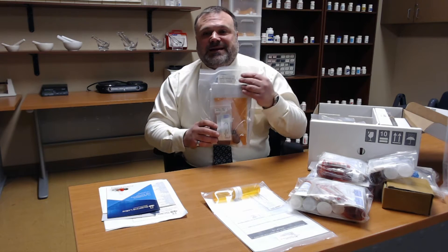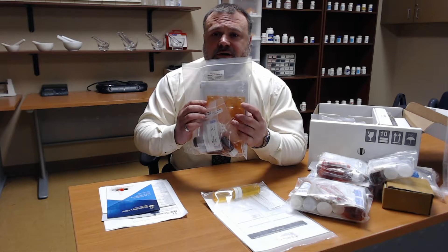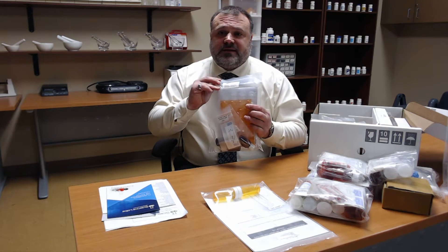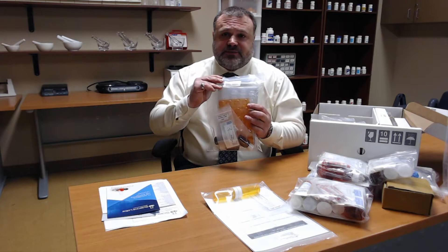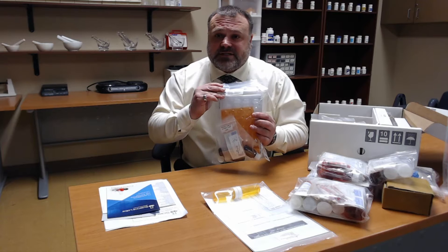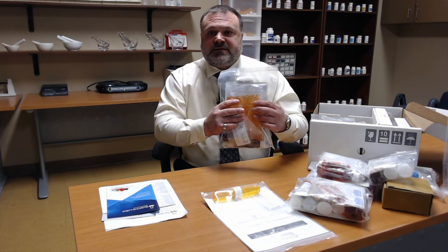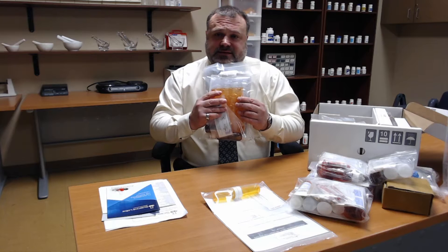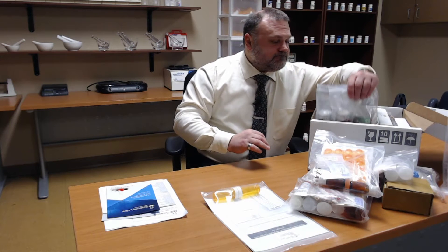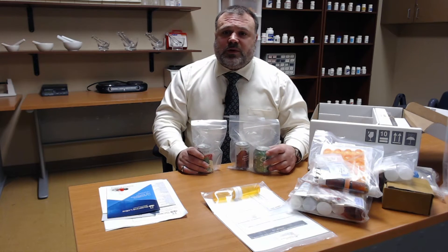This is the labeling and repackaging kit. You'll notice in the background here this orange device — some call it a bingo card — but it is a unit dose device that allows us to dispense to various long-term care facilities such as nursing homes or assisted living facilities, allowing the dispensing of daily medications.